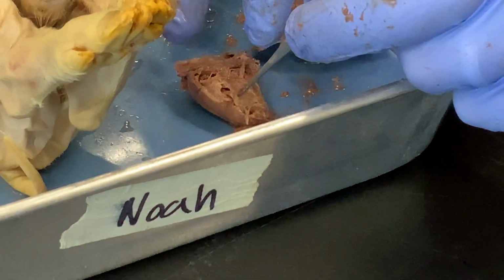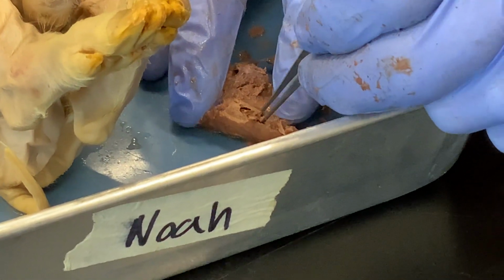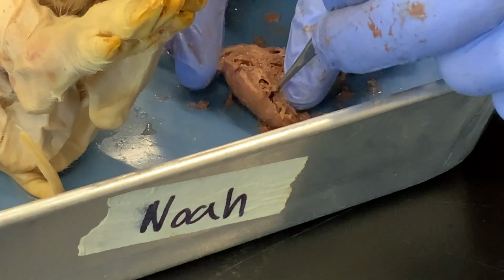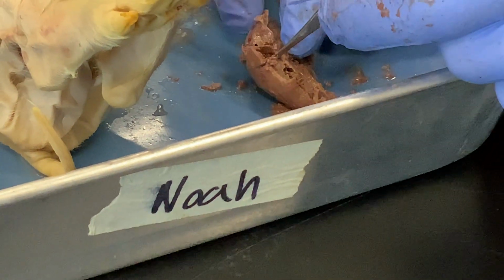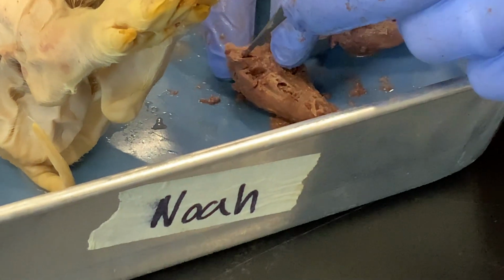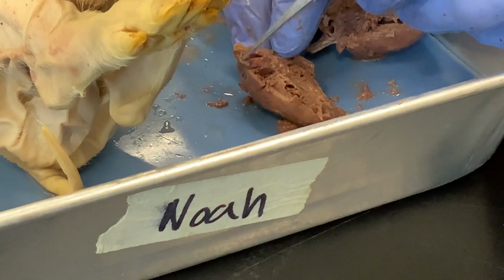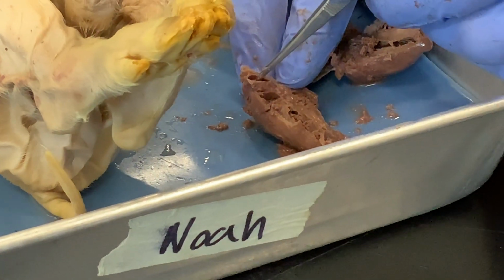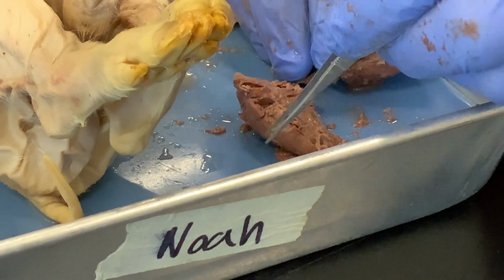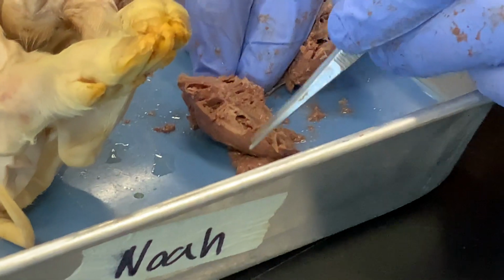So this is a pocket here, and this is another one down below here. Those are the right atrium and the right ventricle. The right atrium here is connected through a very large, thin-walled blood vessel, which cleaned up nicely right here, that has a vertical orientation outside of the heart here that connects to all of the veins in the body.